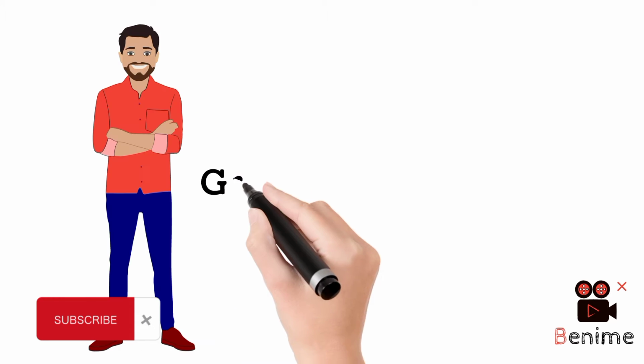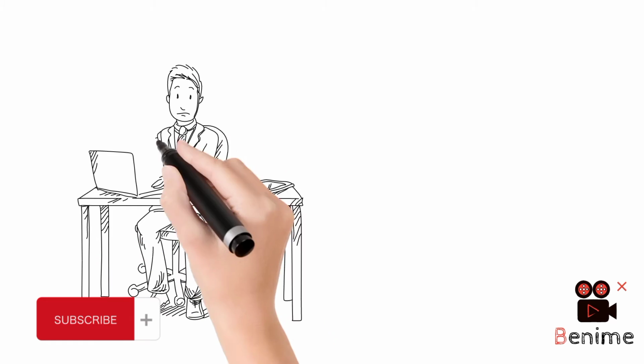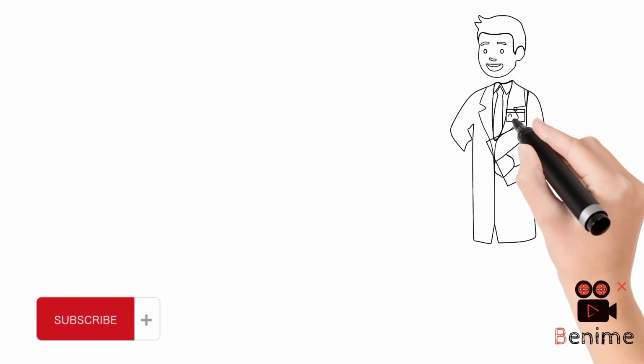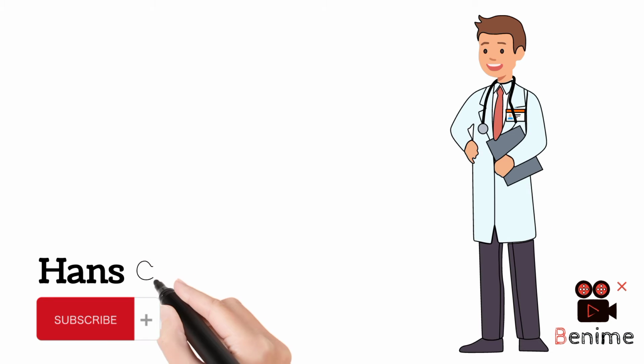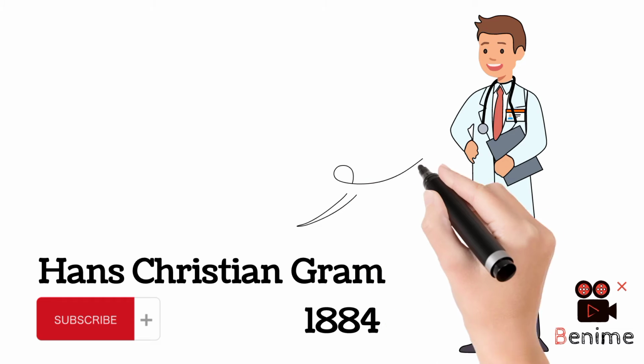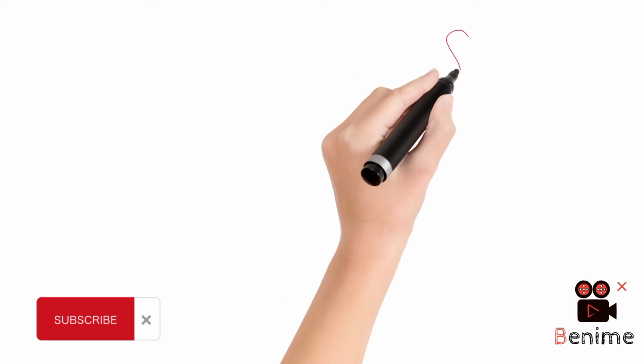Today, we discuss the Gram staining procedure of bacterial culture. First, we clear the concept of history about that. Gram staining was first introduced by a Danish bacteriologist, Hans Christian Gram, in 1884. It mainly works to differentiate between gram-positive and gram-negative bacteria.